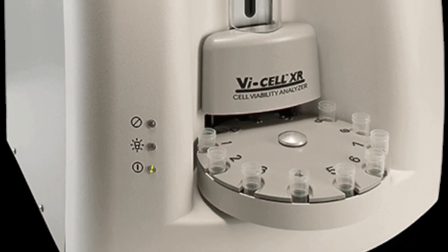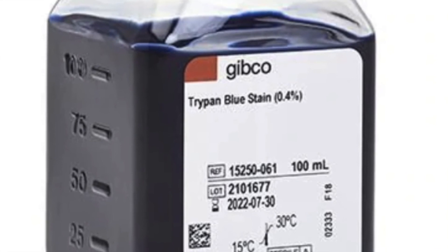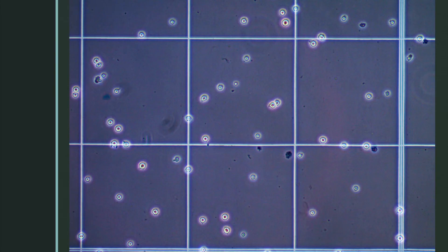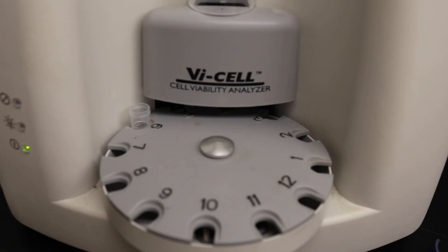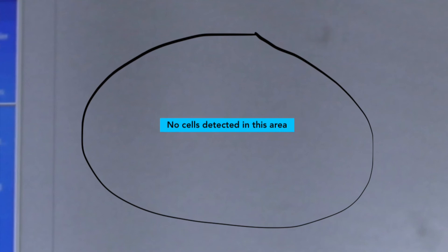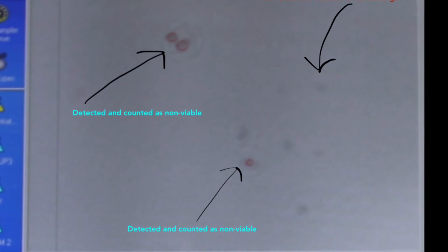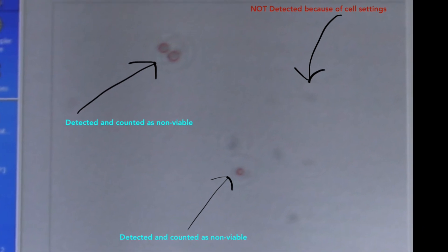In summary, what this machine does is it uses Trypan Blue, a dye, and various other solutions to dye and count the different cells that it measures in the cups that you put into the machine. It does this by measuring the contrast and size of the cells versus the background of different images that the machine takes.